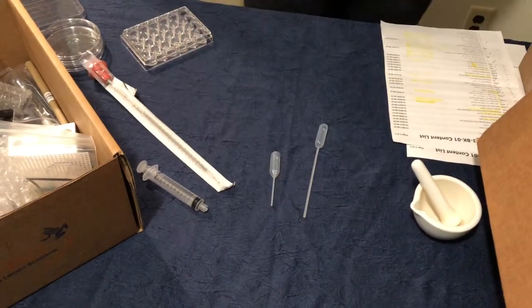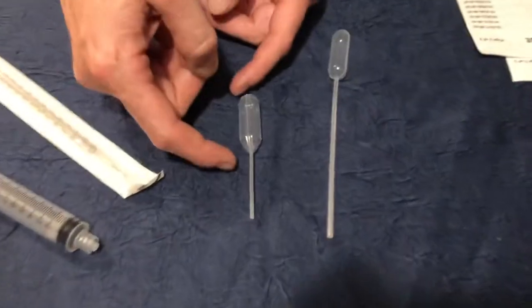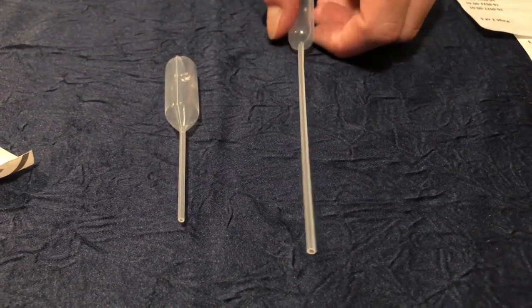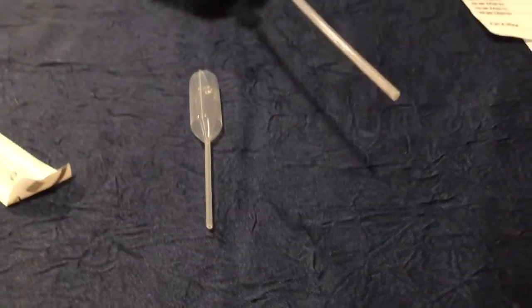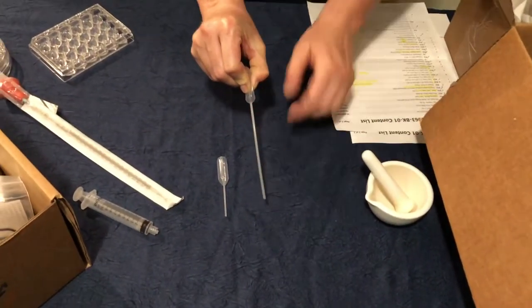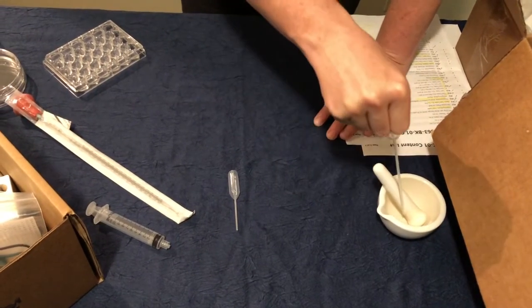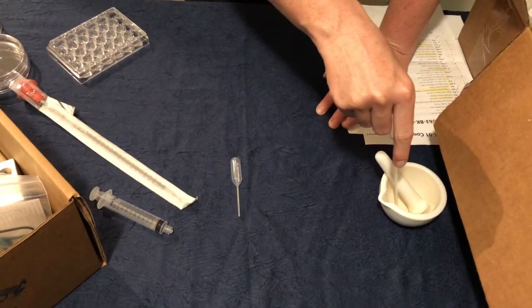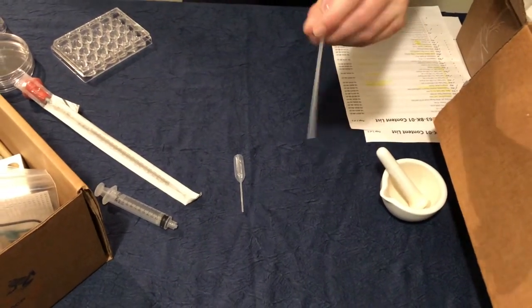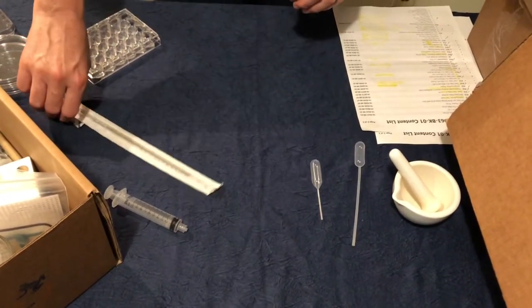These are two different types of pipettes. We have our long thin-stemmed pipette and our short thin-stemmed pipette. A little tip when using a pipette: when you squeeze in, you push air out. So before you want to suck up some liquid, first squeeze in, go into your liquid, and release — when you release, it will suck the liquid up into the pipette.